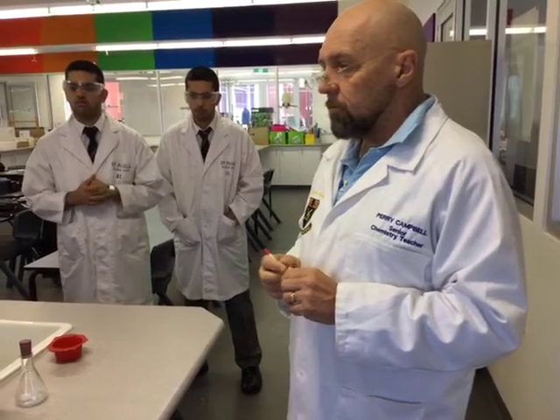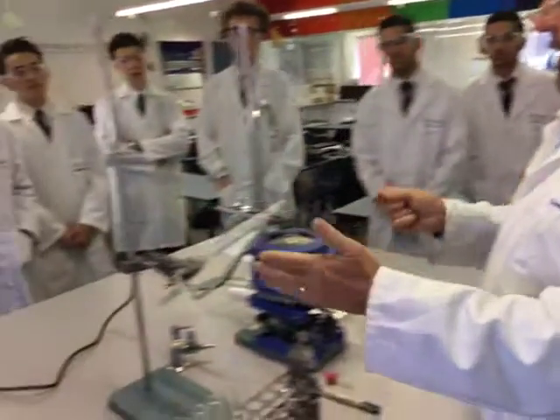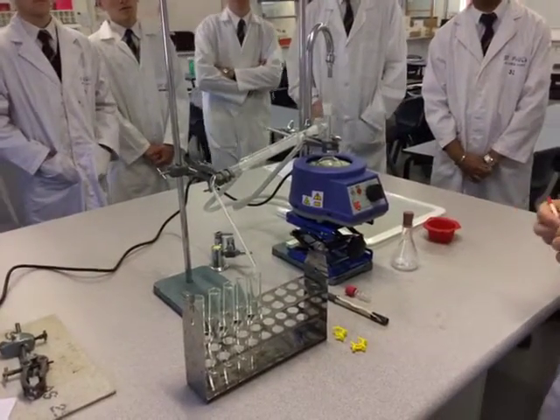What we want to do now is look into the next stage of our ESTA prep, which is a simple distillation. We're part way through setting up our distillation, our quick fix set for distillation.